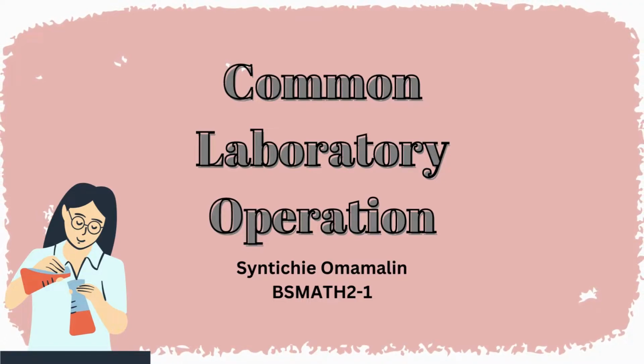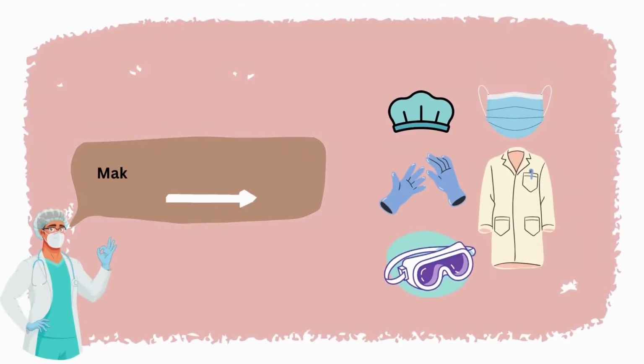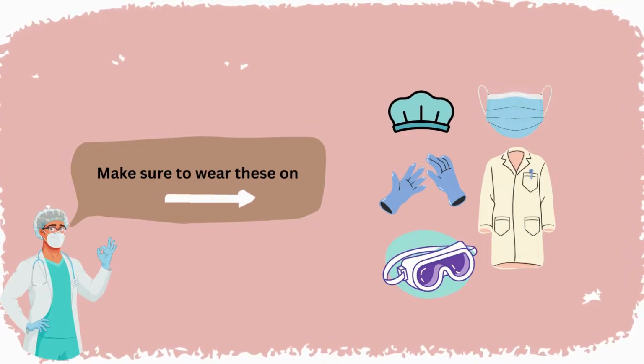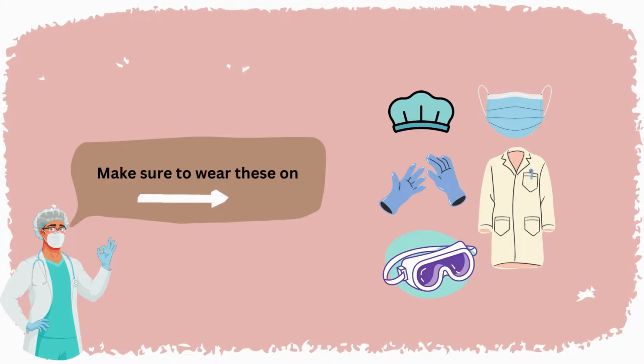So for today's video, I'm going to do the common laboratory operations. Before we start, make sure to wear proper PPE and laboratory attire, which help minimize the potential for skin exposure to hazardous chemicals.